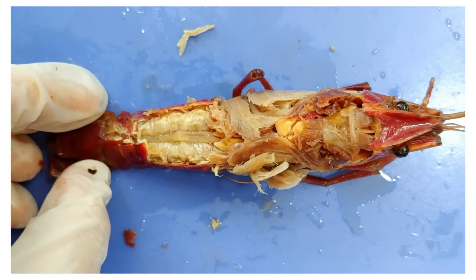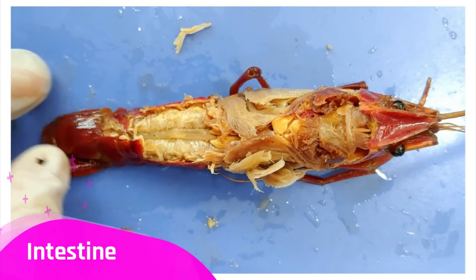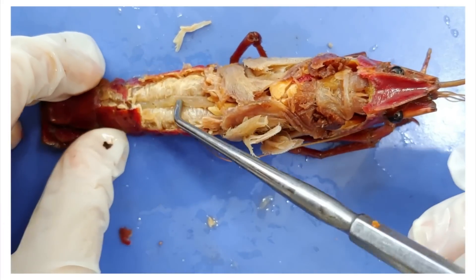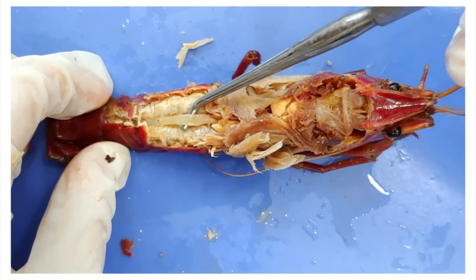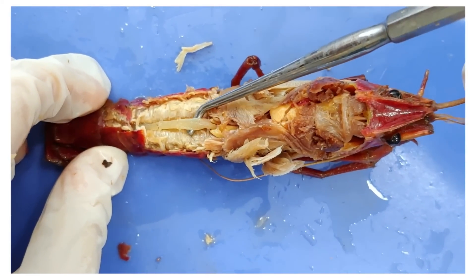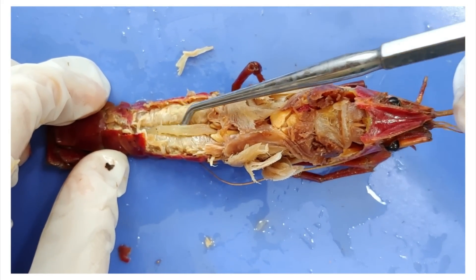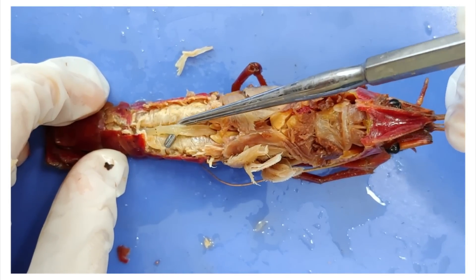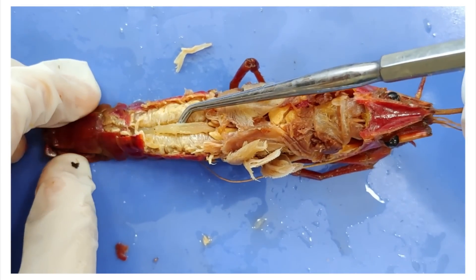Running along the groove in the abdomen is the intestine. I'm going to put my probe under it. This is also the part that gets removed when you devein a crayfish. I say eat it with the rest of the flesh — then you'll get to taste both the crayfish and its last meal. Yum.